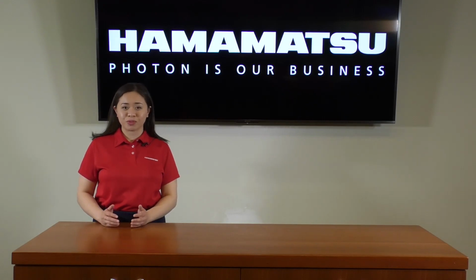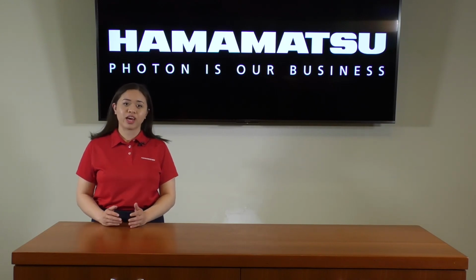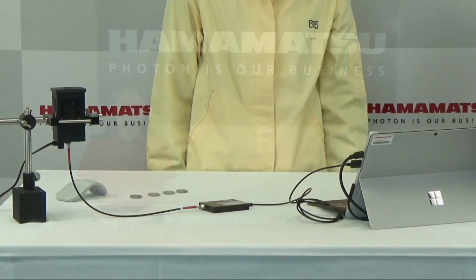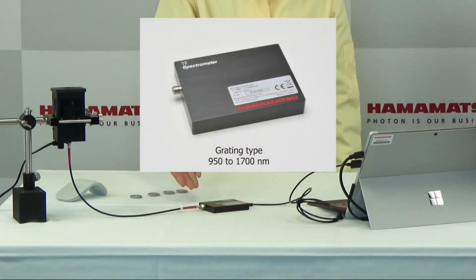When measuring different pharmaceutical compounds, again, it's important to match the spectral range required, whether that's absorption or emission, to that available on your spectrometer. Finally, measurements will be made with a Mini-Spectrometer.